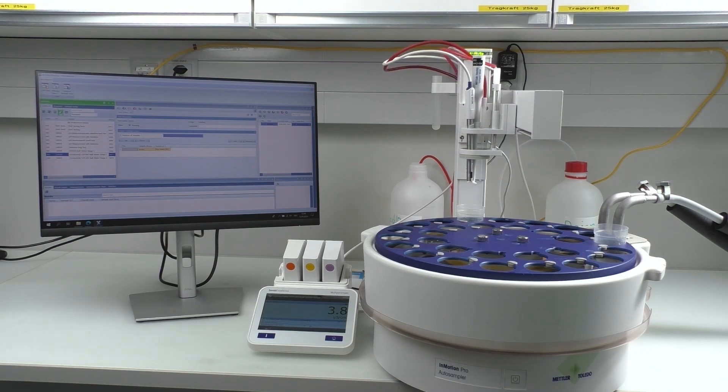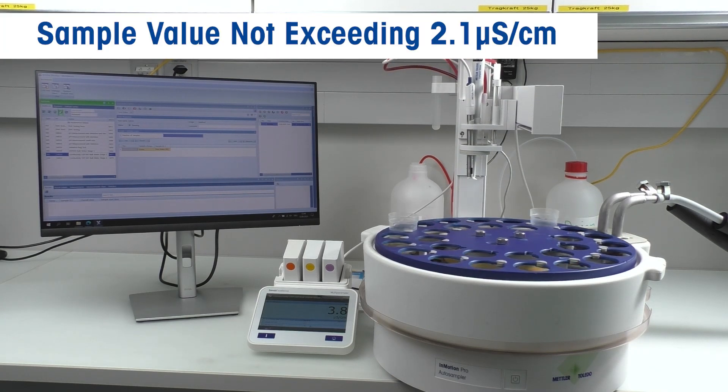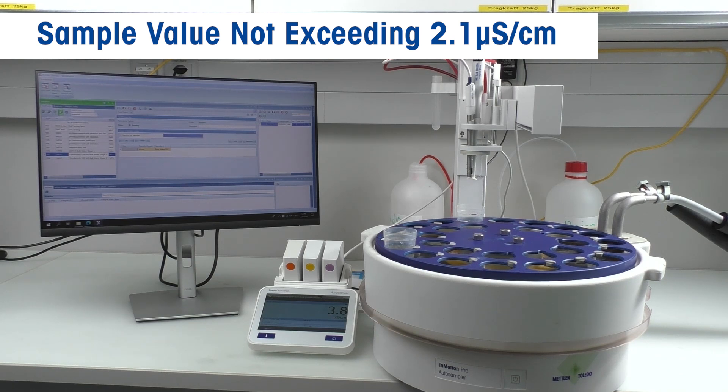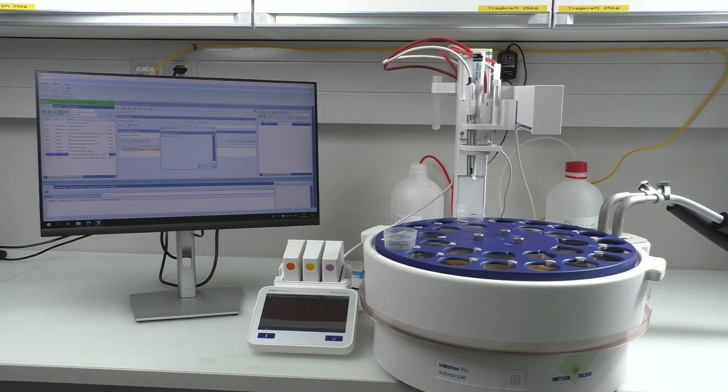In case the new conductivity reading does not exceed 2.1 microsiemens per centimeter, the test meets the requirement of stage 2. If the sample fails, then we proceed with stage 3.